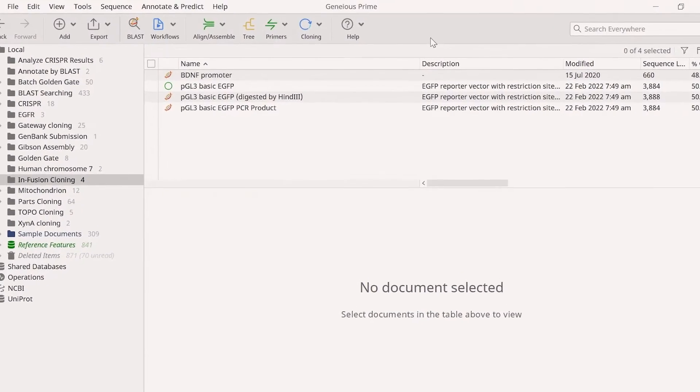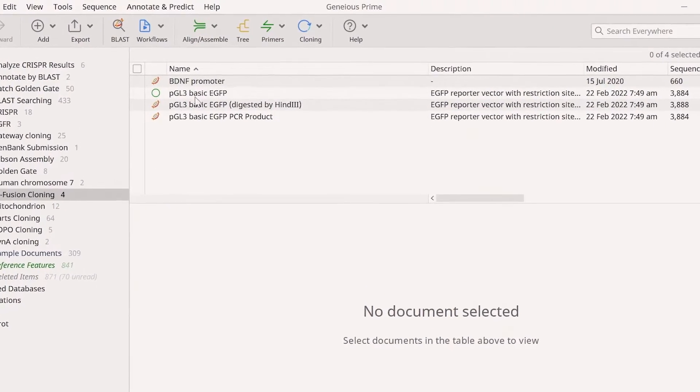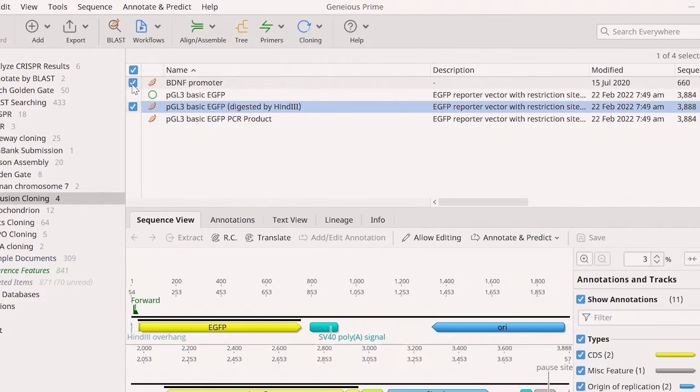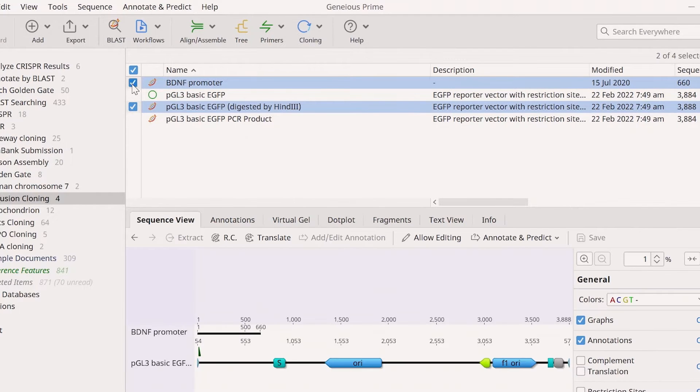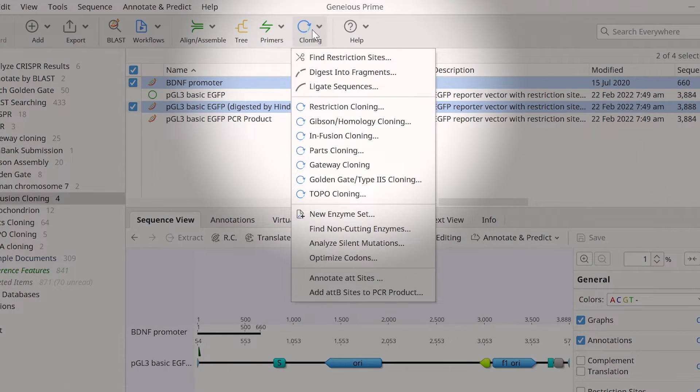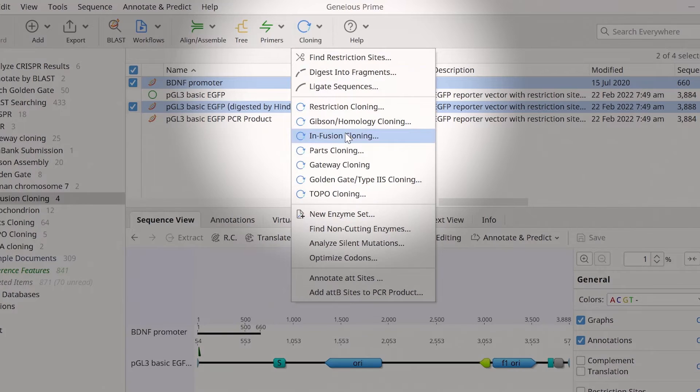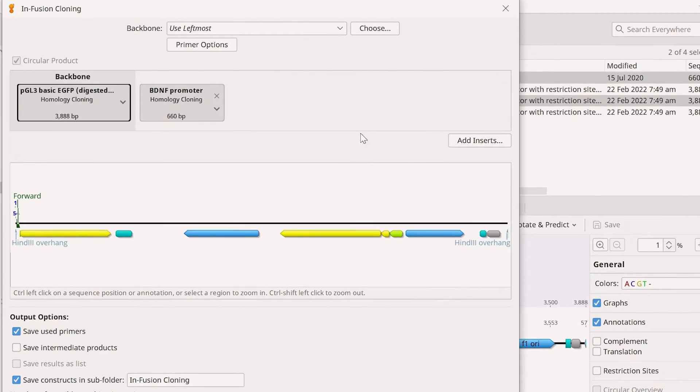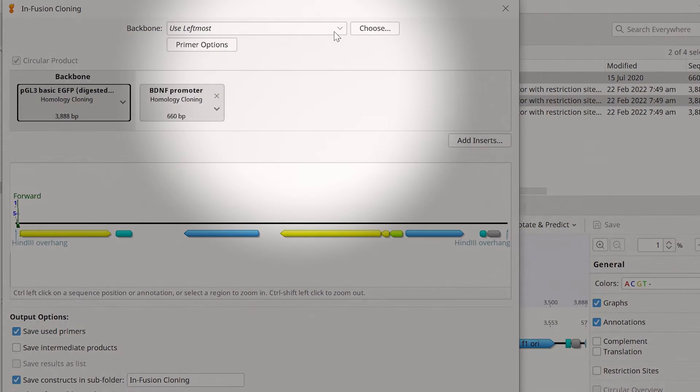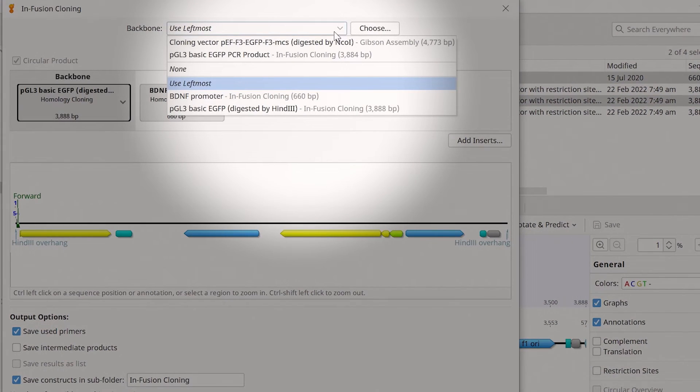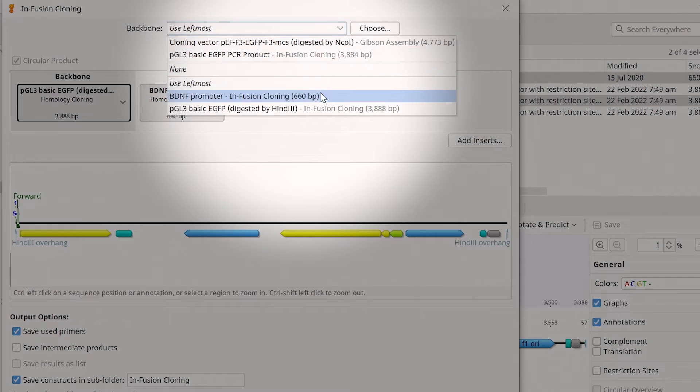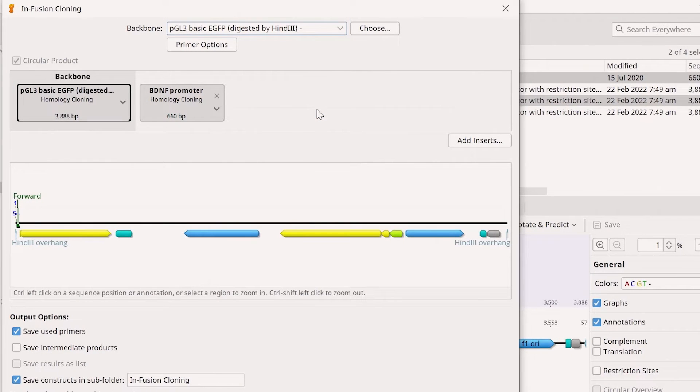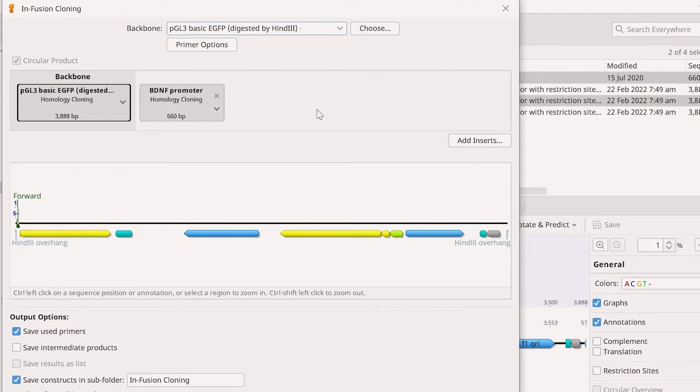To do this, select your linearised vector and the insert files. Then, select Cloning and choose the Infusion Cloning option. In the new window, use the drop-down menu at the top to specify the backbone file. The Infusion Cloning tool automatically ensures a 3 prime exonuclease is selected for the simulation.